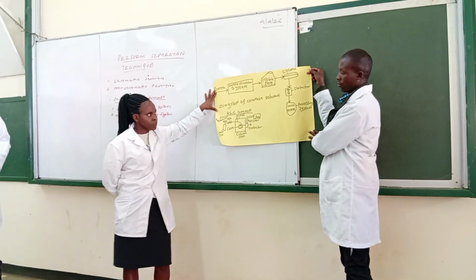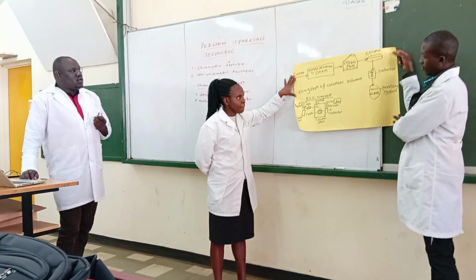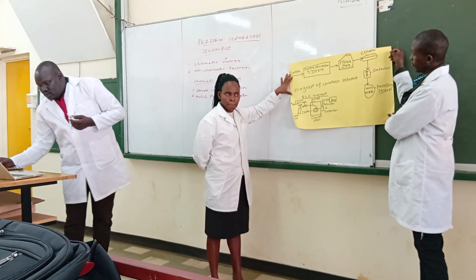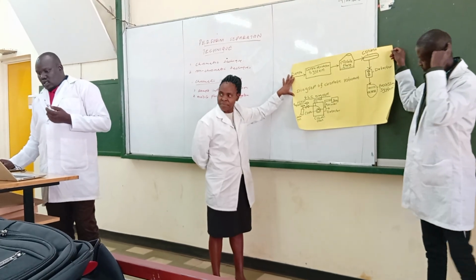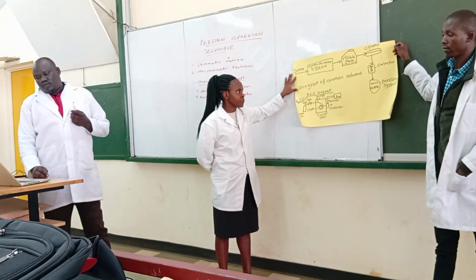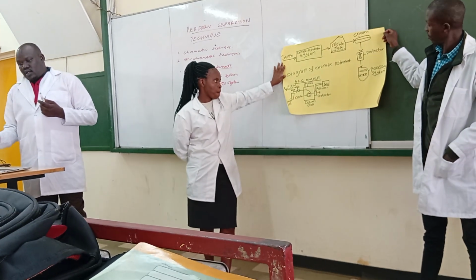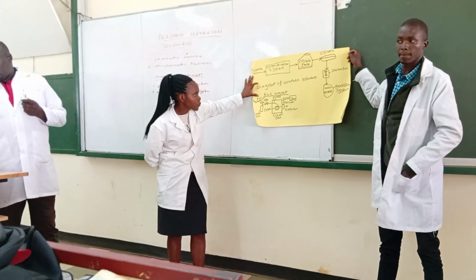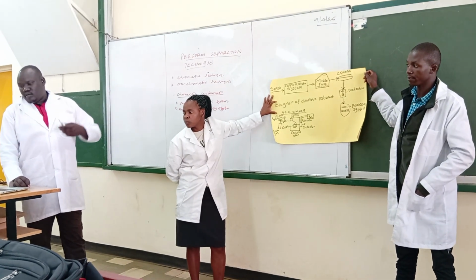It transports the samples through the stationary phase at a controlled flow rate and pressure. That is its function. Examples are HPLC, which uses high pressure pumps, and GLC, which uses carrier gas cylinders with flow controllers, such as helium or hydrogen, as the mobile phase.